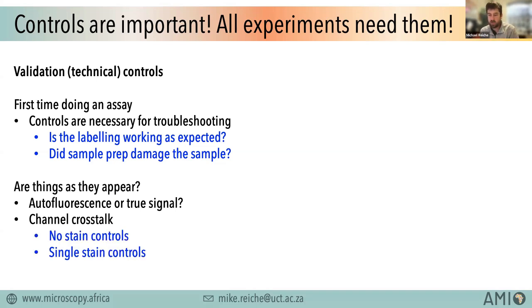A no stain control is very important. It helps you establish whether your protocol has worked or not. Single stain controls are also really important because they allow you to look at your feature of interest in isolation, and does it look the way it should look?